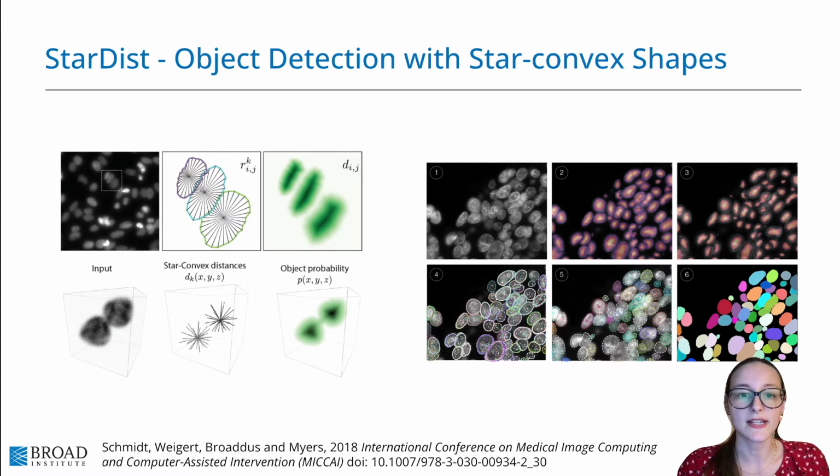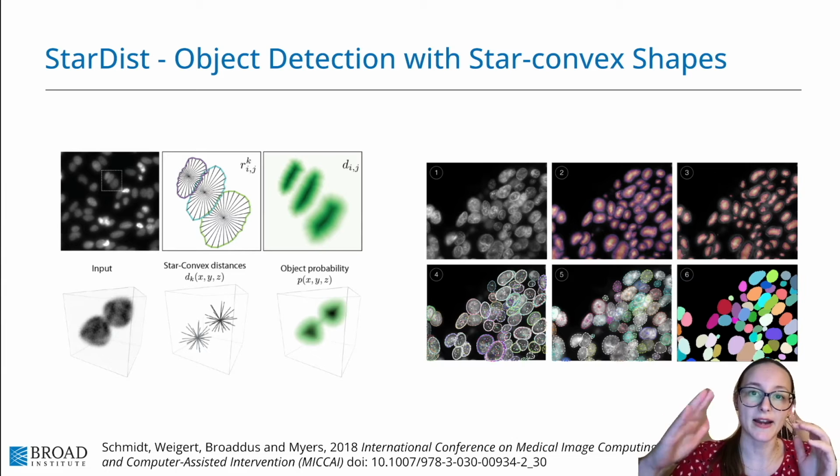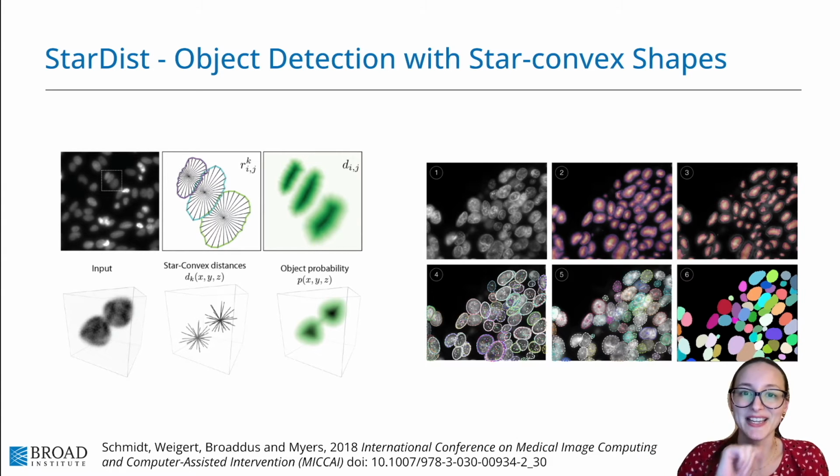When using StarDist, the most important thing probably to consider is it is going to assume star-convex shapes. Again, shapes that are roundish, that don't have dramatic puckering in, or C shapes. In general, we want roundish objects for this, where a point can see the entirety of the edge.